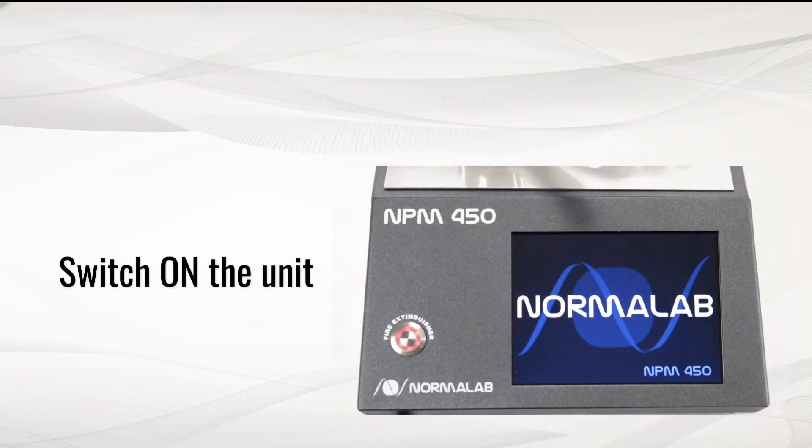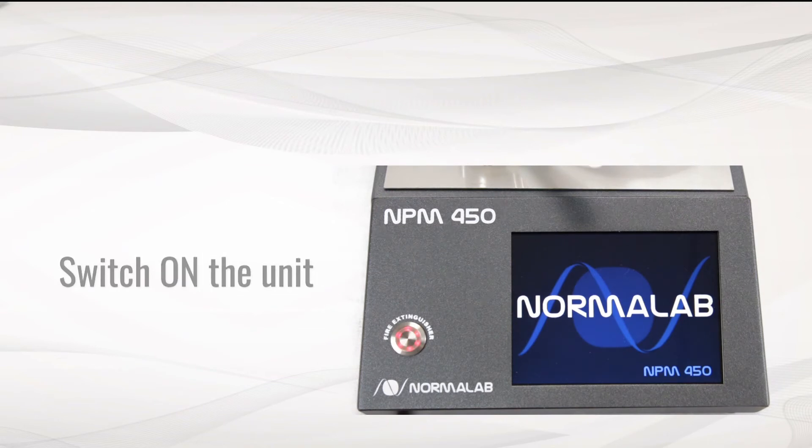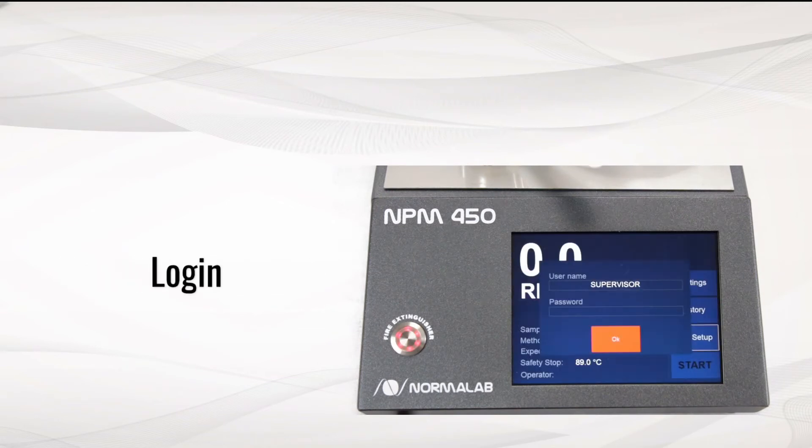Switch on the unit from the rear button. Login using username and password.